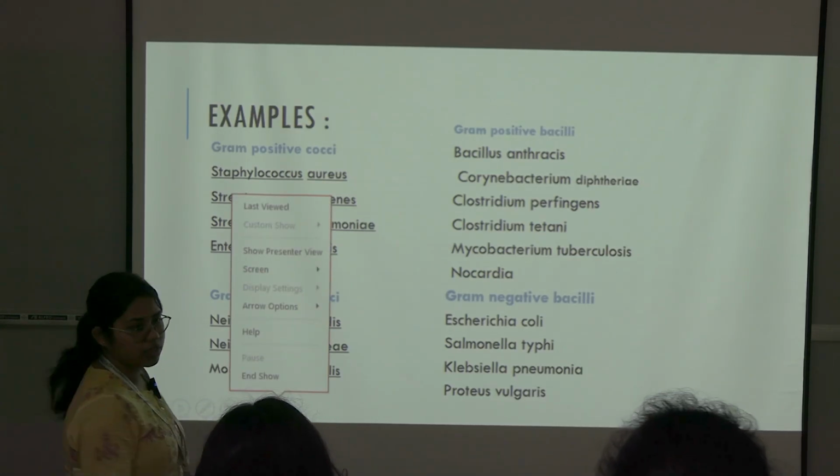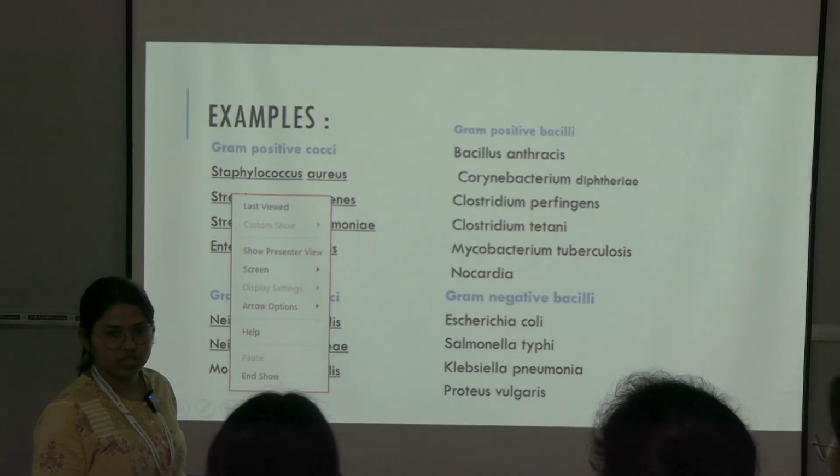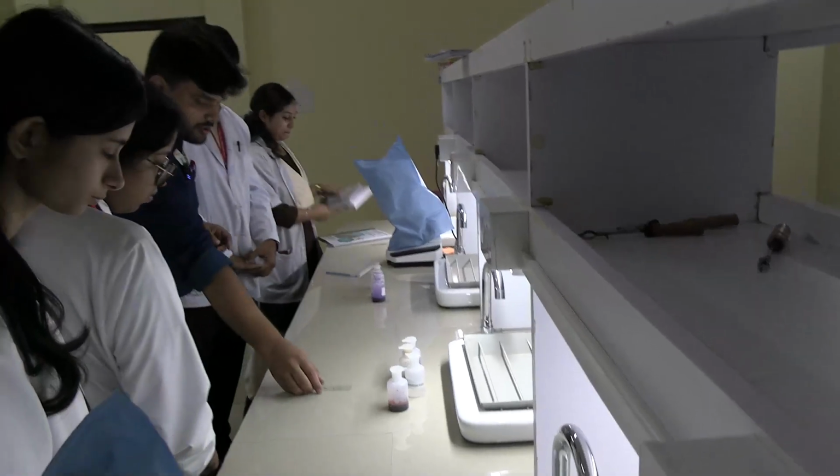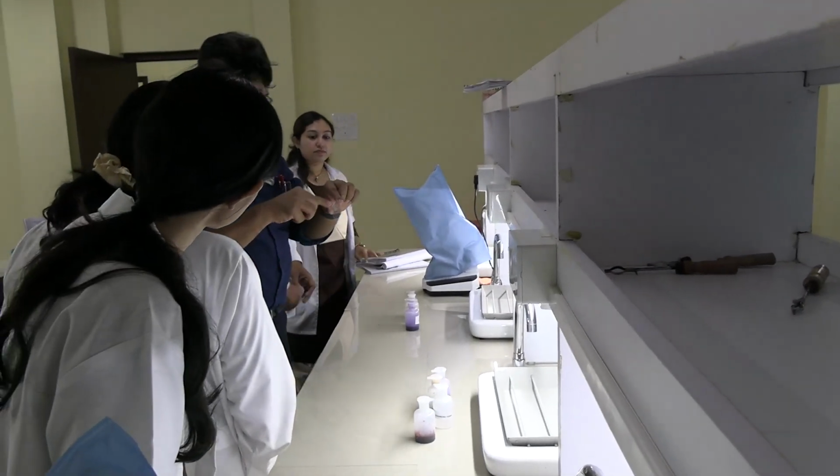So now you can go for the practicals. We will be doing the procedure today, two people at a time, okay? Be careful, there is a smear. You can see now that the smear is fixed here.